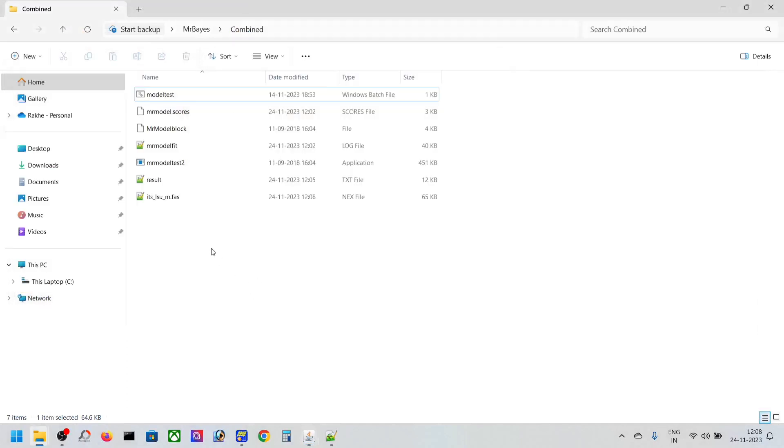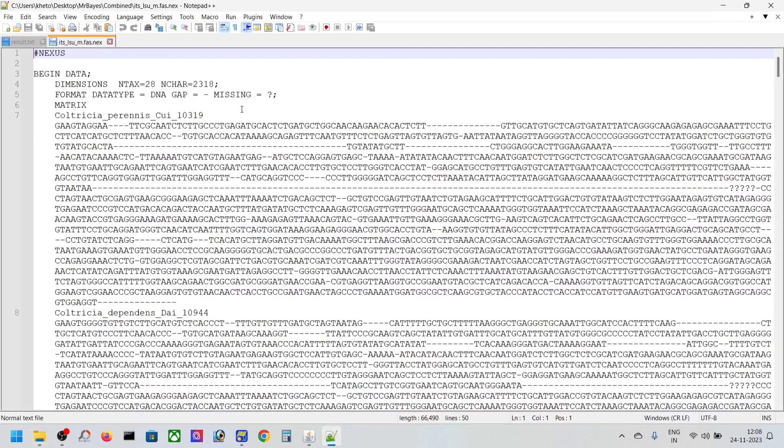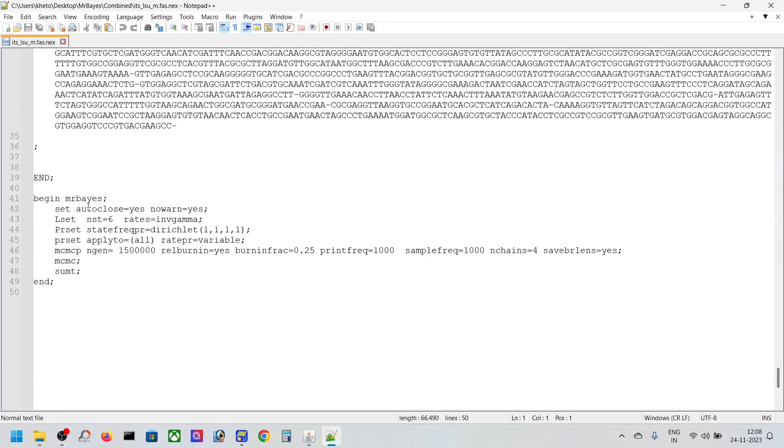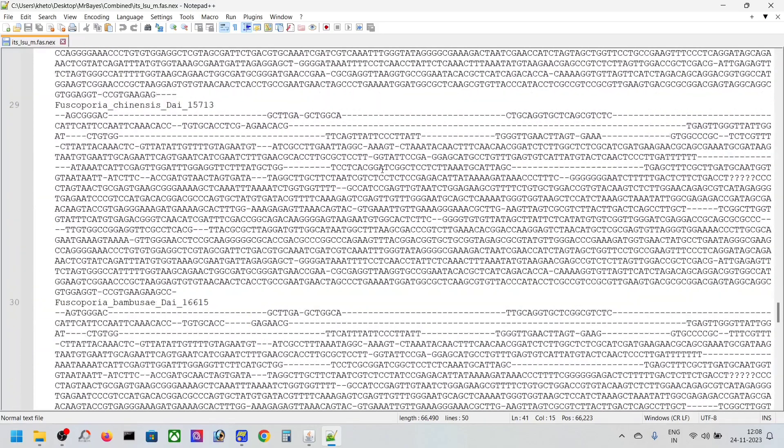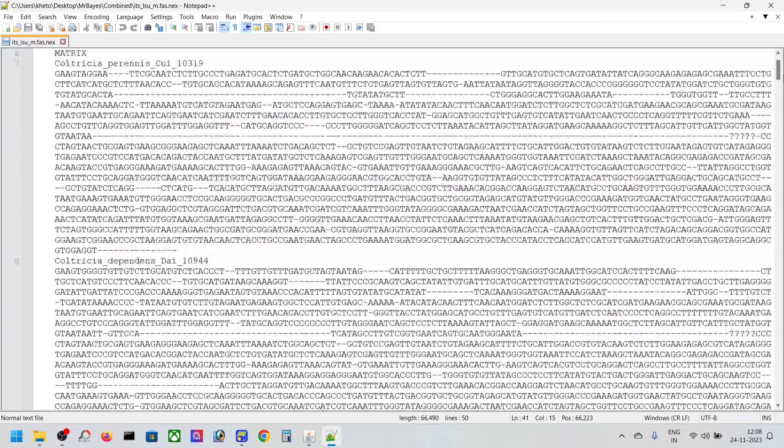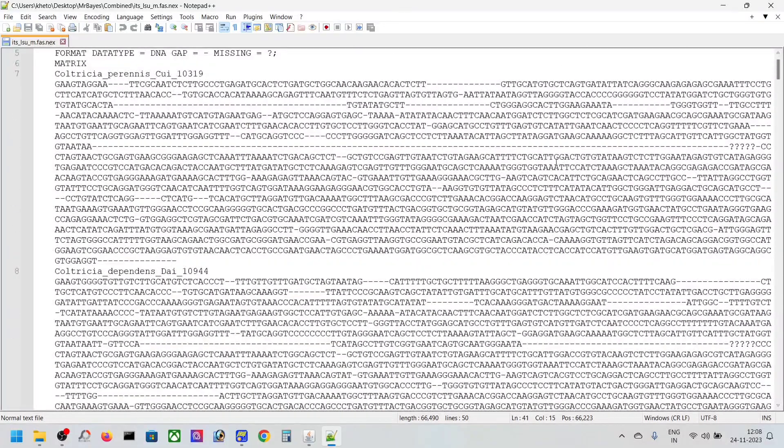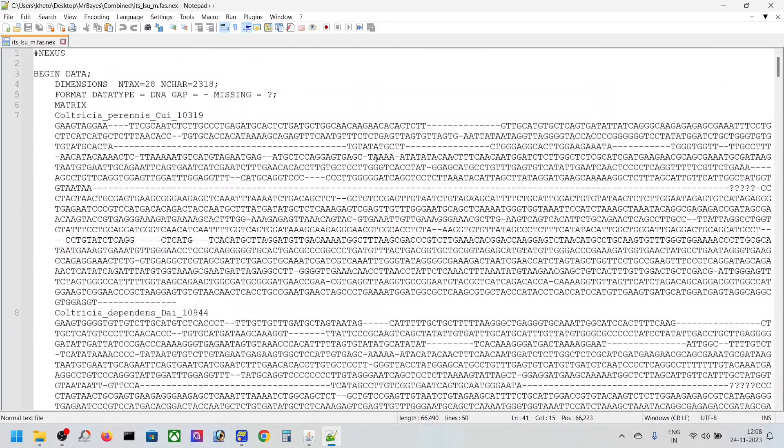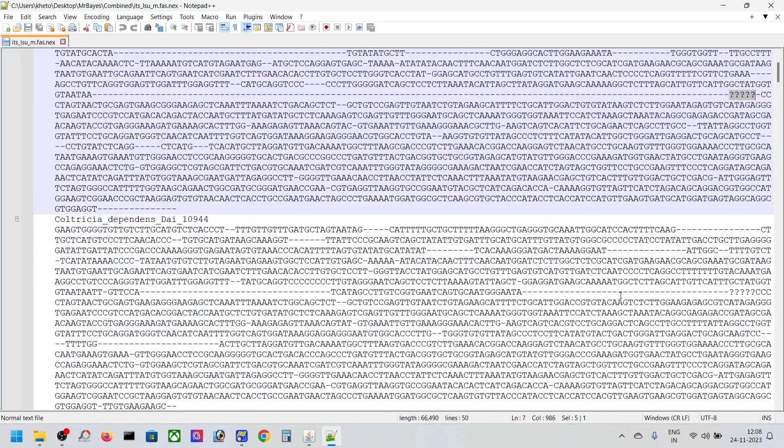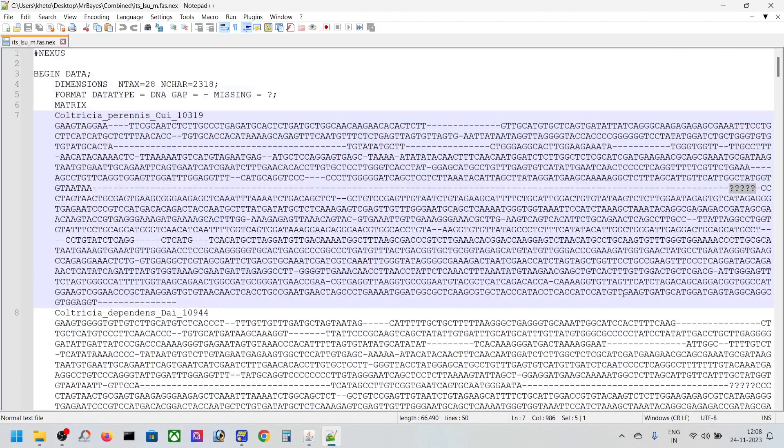Then export and save it. We're already done, so now you can see the Nexus block here. You can view your Nexus with MrBayes block at the bottom. For this sequence, we have ITS, LSU, but if you remember we have gaps here—question marks and escape characters. We must not include this gap region that we put in our previous alignment.